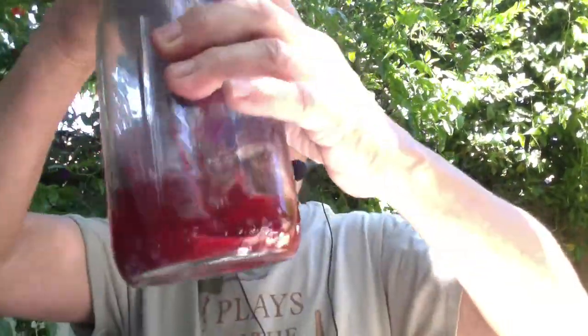So based on the TSA plate, we know there's a wide variety of both bacteria and possibly fungi, yeast, growing on the grapes. So then, folks, we processed the blueberries and the grapes. We squished them up and tried to keep them under anaerobic conditions for a day. And you'll recall, you guys, after 24 hours, even less than that, when I went out and checked the container, when I released the cap, there was gas escaping. So I was like, I think we had a pretty good fermentation going on. So then yesterday, that would have been day 2, I took samples of the grape juice and the blueberry fermented juice, and I plated them onto TSA plates.